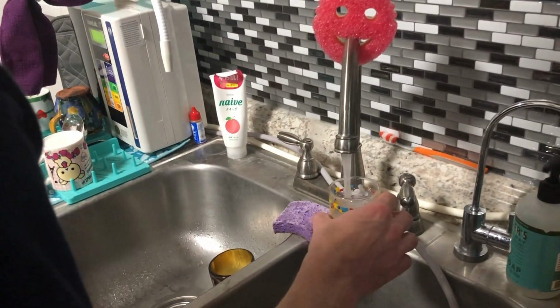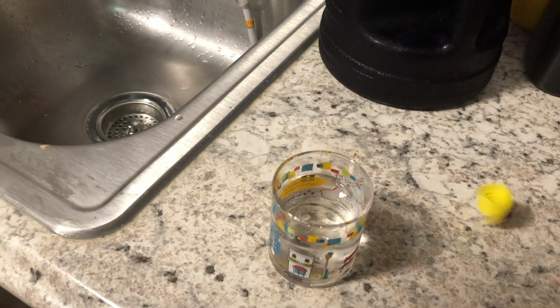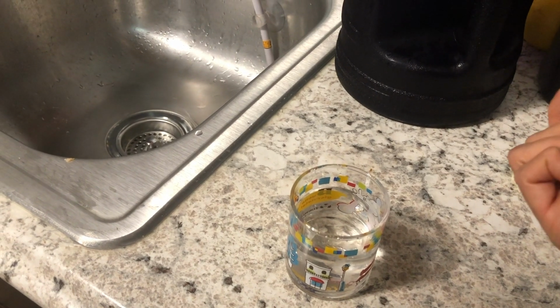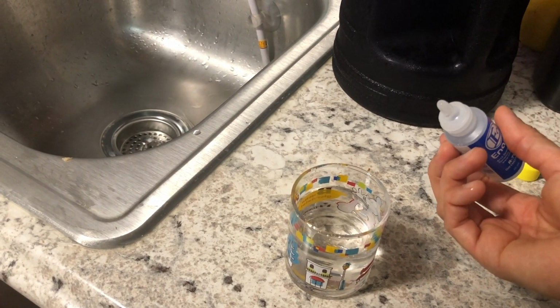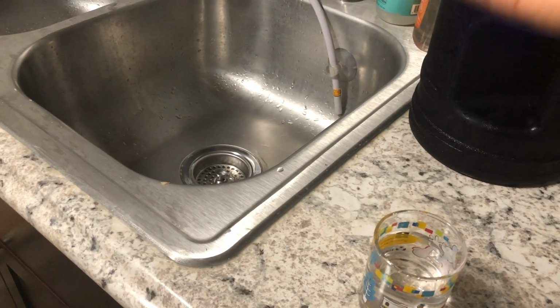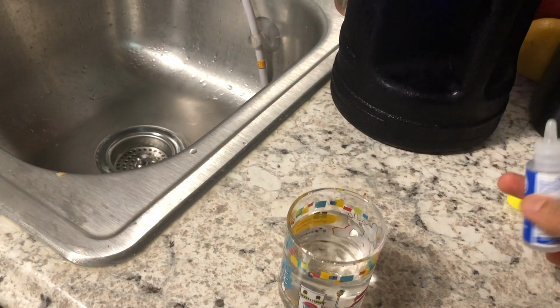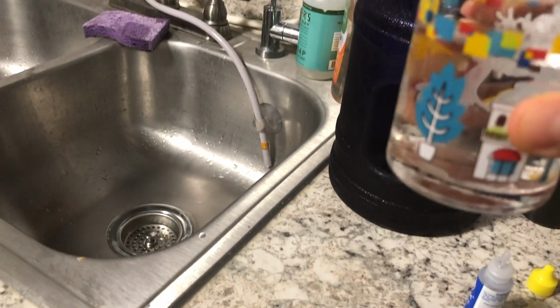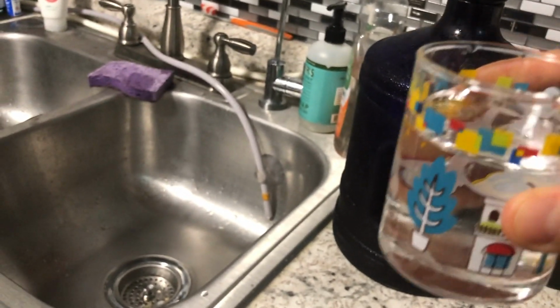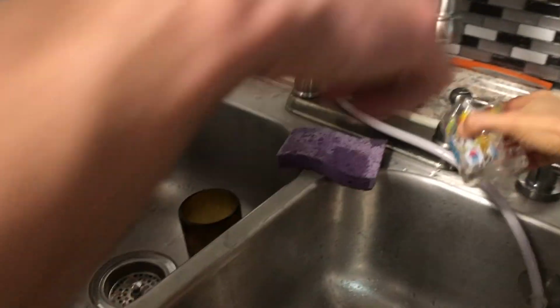Okay, so now we're gonna, of course, test the tap water. My guess is, since the water hasn't run for a while, there won't be any chlorine probably, but if there is, then we'll have to let it run longer, because sometimes the water that remains in the pipes, the chlorine kind of disappears after a while. Yeah. So that is 3 drops. Normally it turns orange or yellow, but I don't see that it turned. So we're gonna let the water run for a bit longer and see what happens.